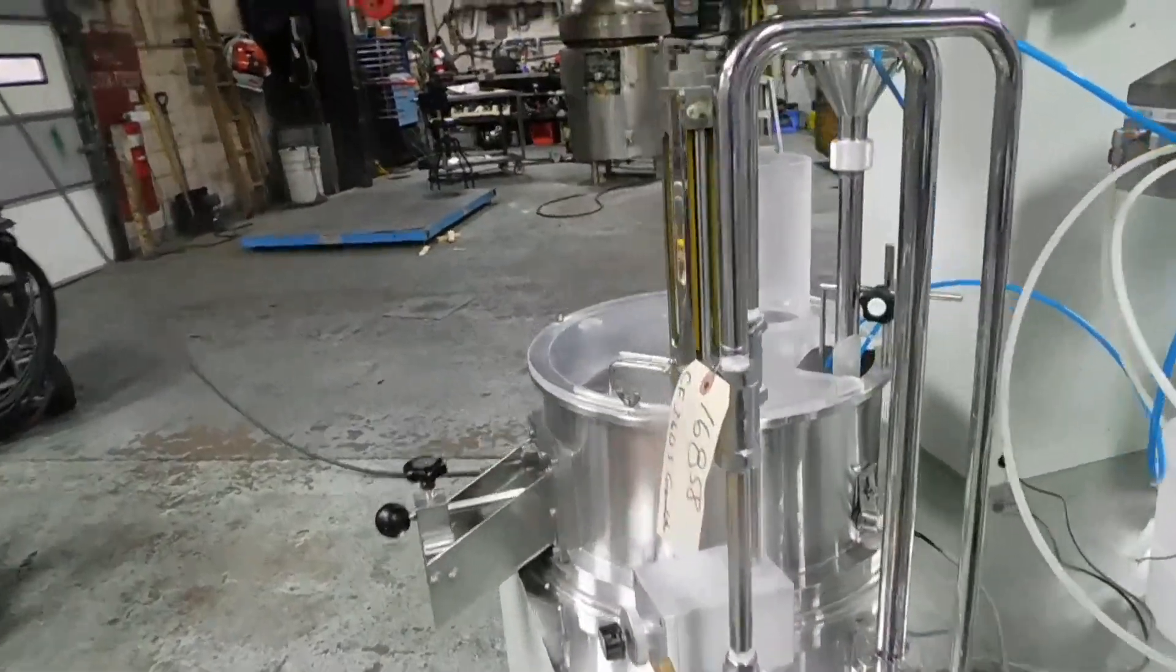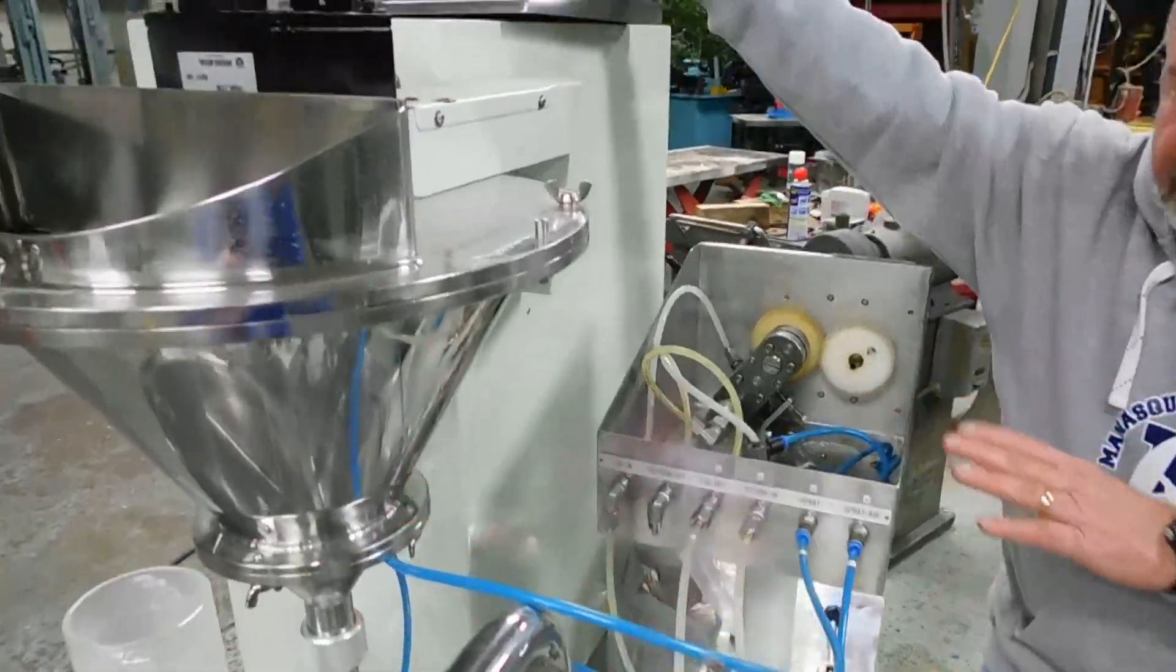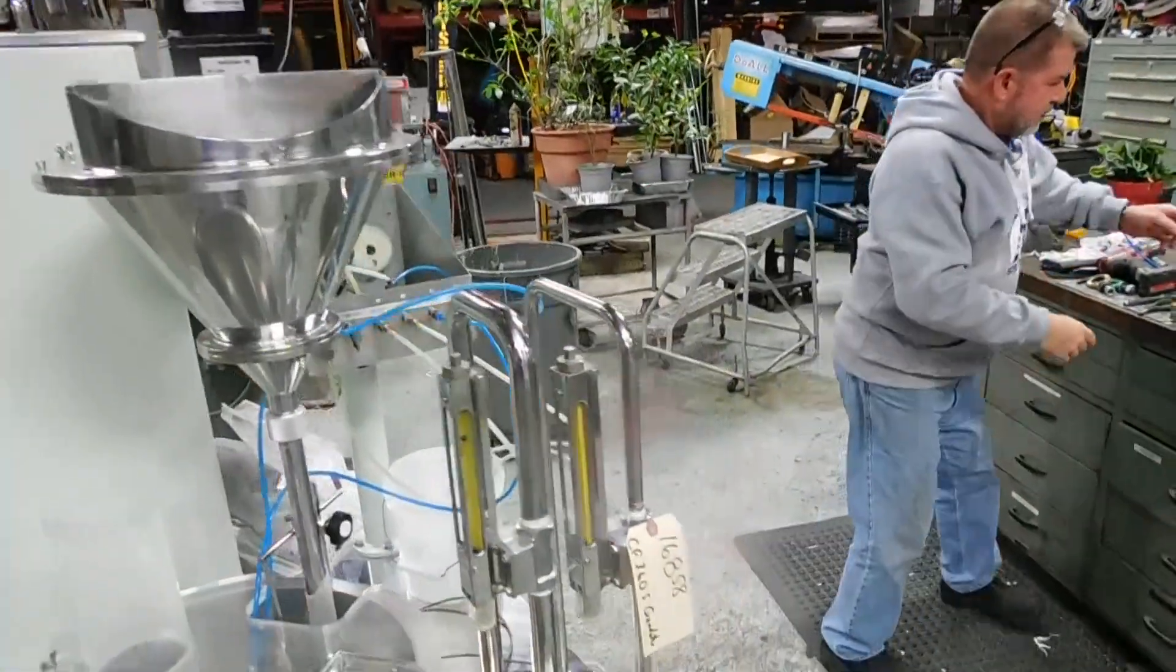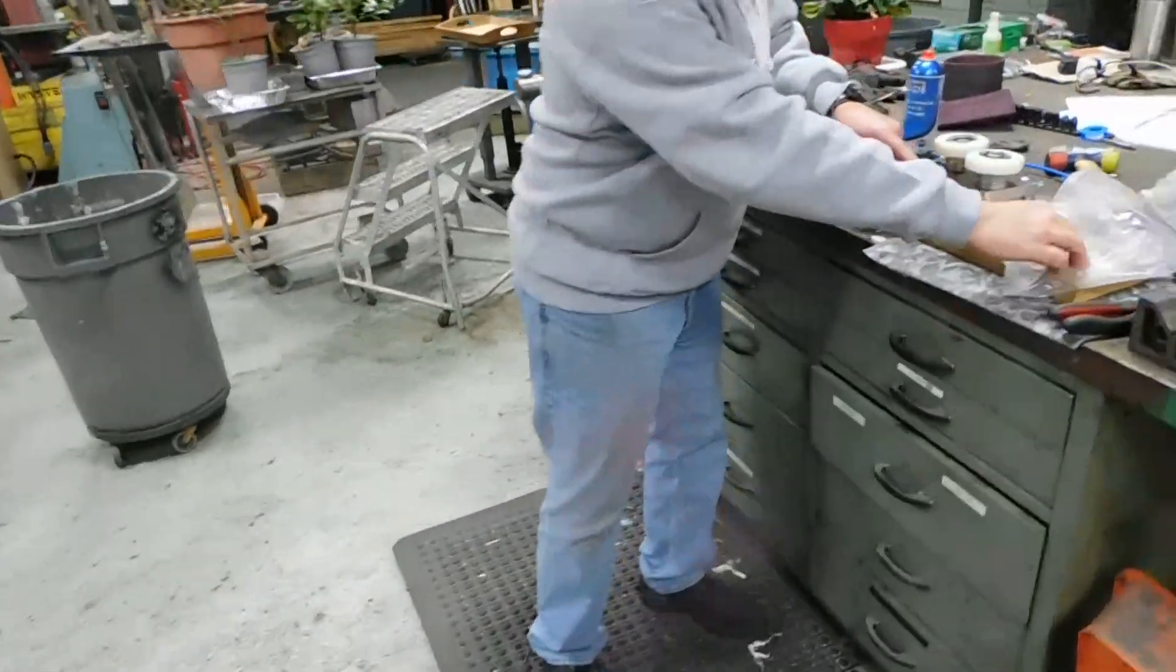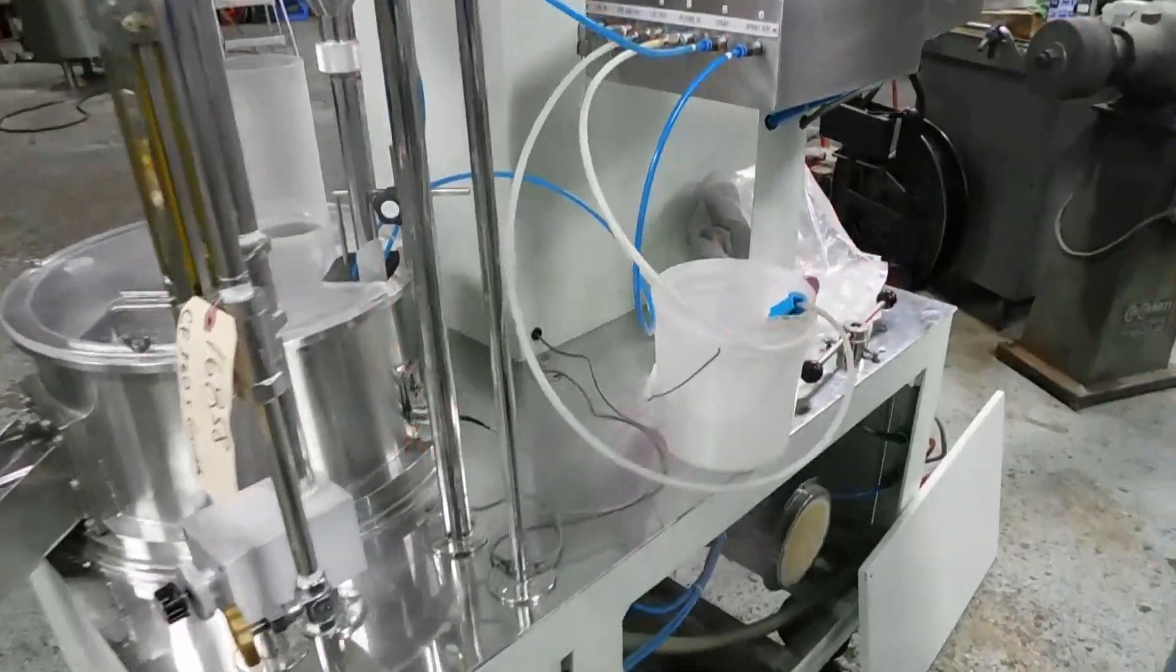Everything seems to be operating. We have the complete cover for that up top for the pump area. Also, along with the unit, let me show you real quick, there are two spare pumps, one spare auger, a couple of miscellaneous parts, some dust socks, things like that, a couple of tools they created.